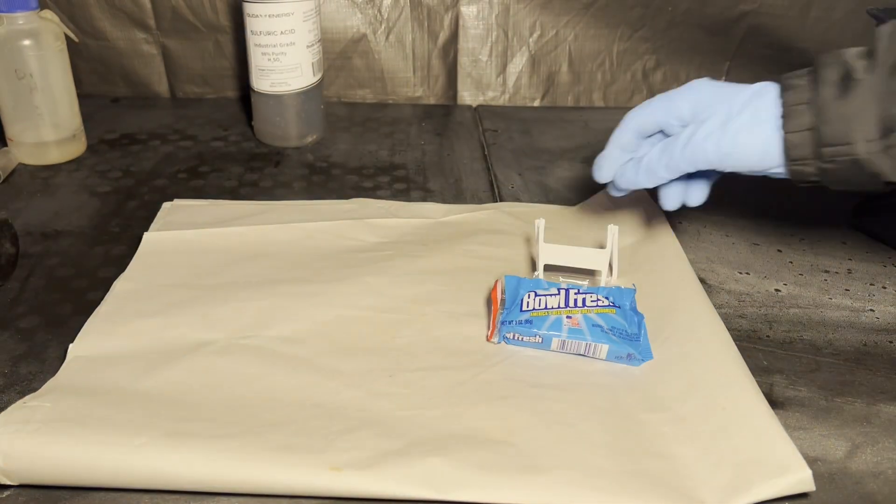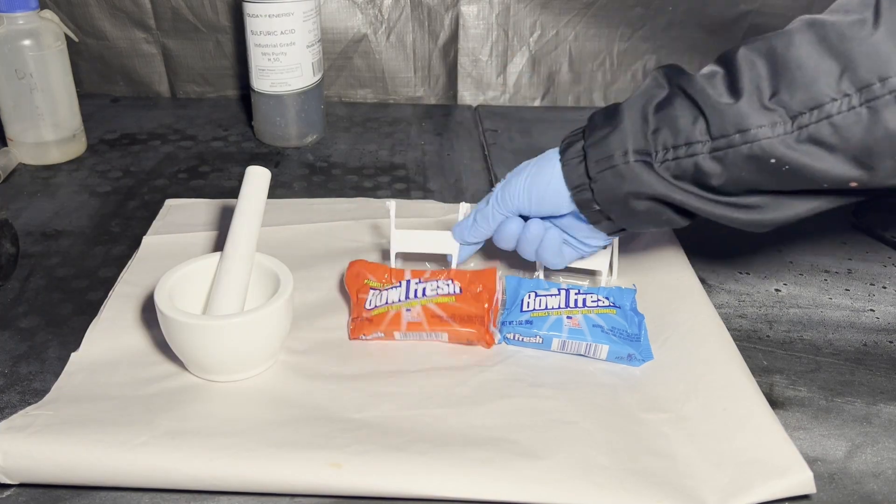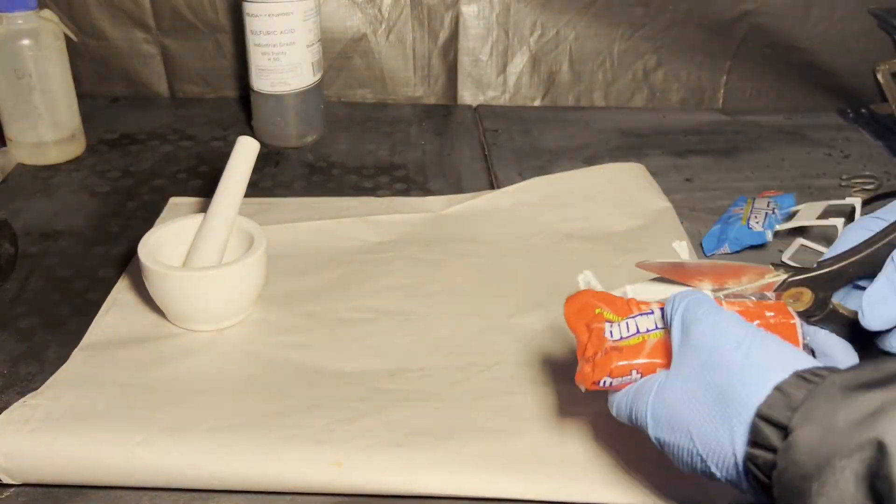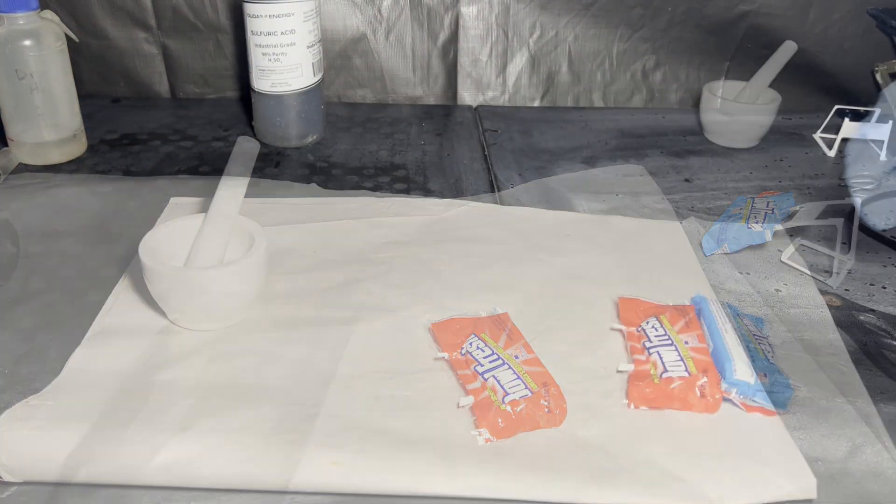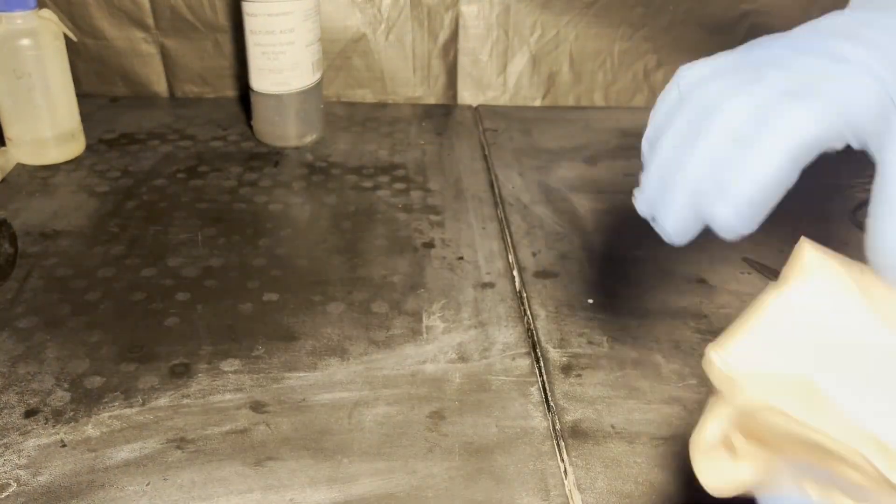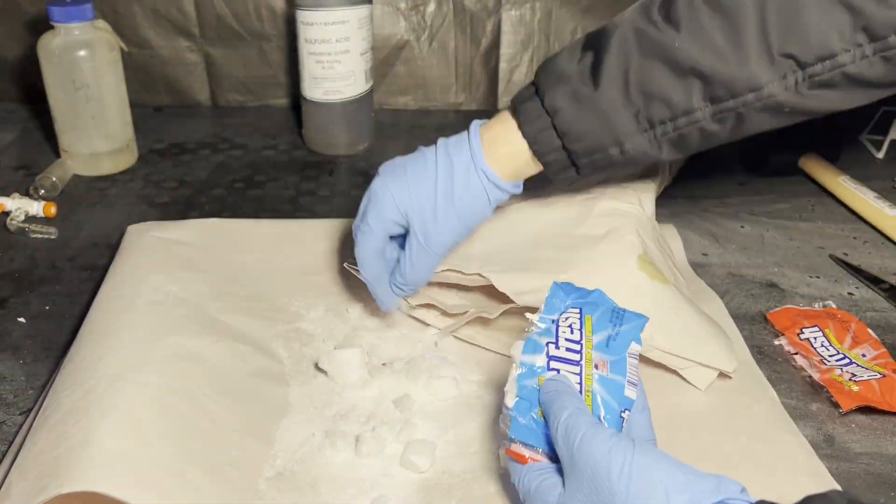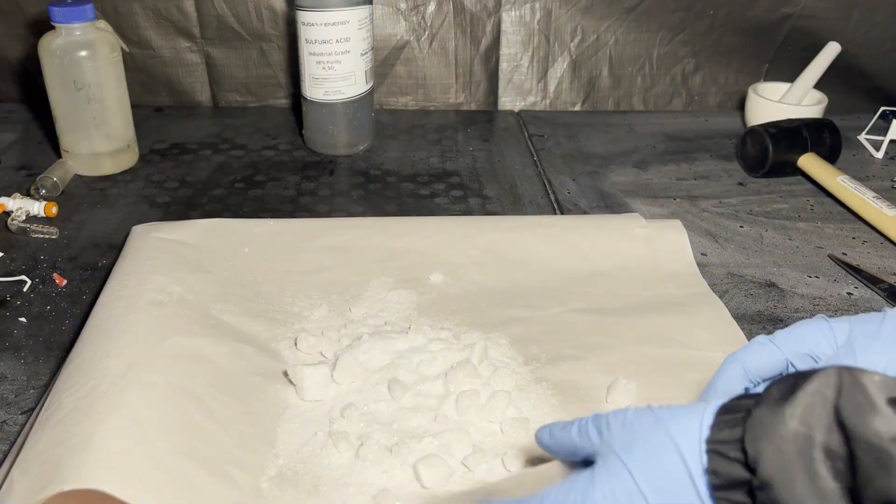I'm using two of these toilet deodorizers I got from Walmart for like $1.30 each for the second run. I used one for the first run. They have this annoying plastic hangy thing that I need to remove, and it's all in one solid chunk, so I have to crush it up. I do this by wrapping it in packing paper and bashing it with a mallet.